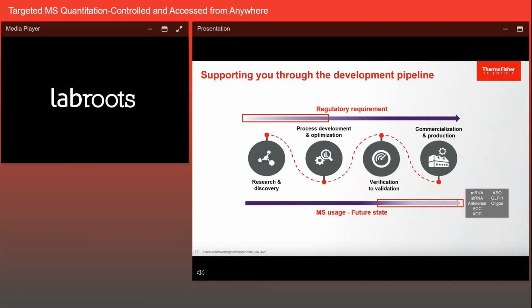With the rapid increase in biopharma applications and larger molecule therapeutics and new modalities, and the increased difficulty in separation of impurities and modifications, the need for quantitative mass spectrometry in this routine QA/QC segment is heavily increasing. This increased need is also having an impact on the scrutiny applied further down the pipeline, with regulators being more aware and wanting to see how data has driven decisions earlier in the developmental process.